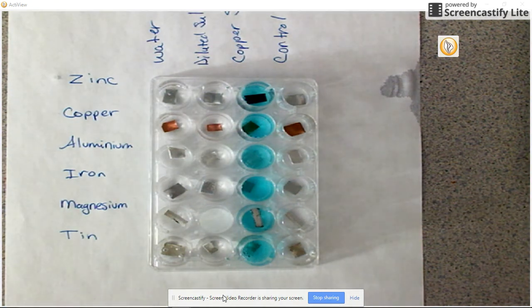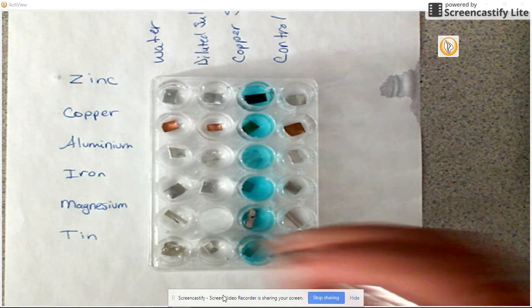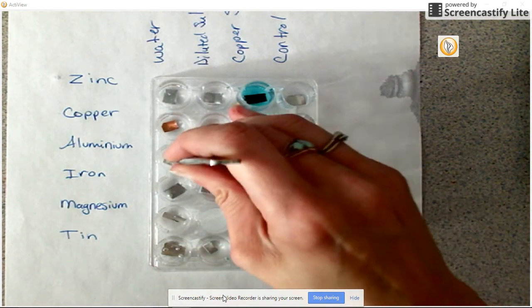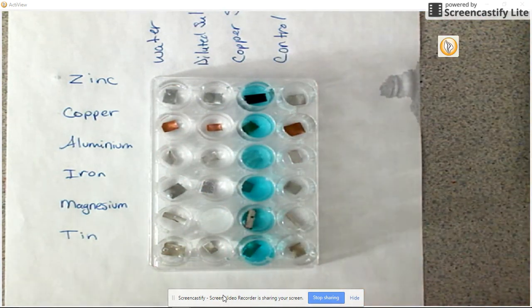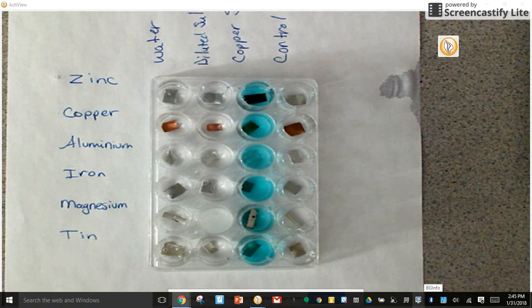All right, let those initial bubbles settle out so that we can see what happens. All right, use my tweezers to make sure these guys are in their liquids. I've apparently spilt something, so I need to make sure to neutralize that.